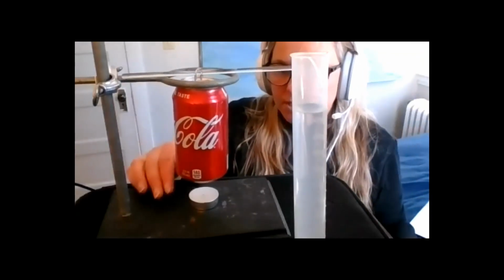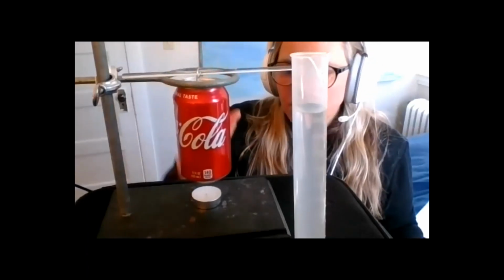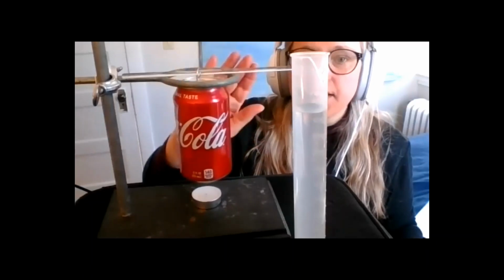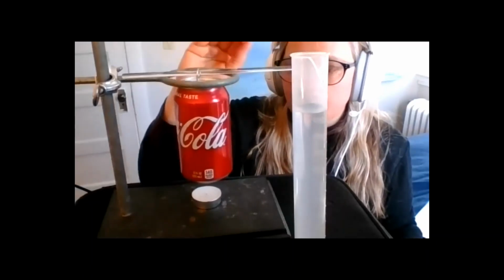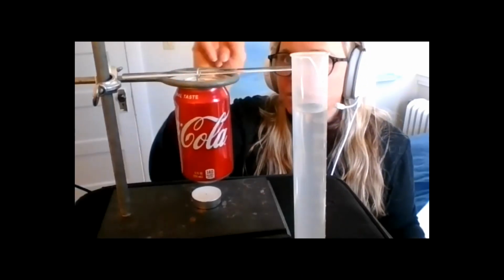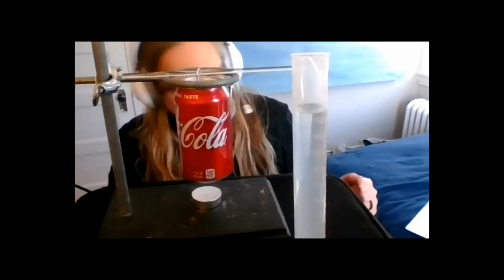Blow out the candle once it's at the goal temperature and wait. It might heat up just a little bit longer. It'll take a little bit of time for it to get its highest temperature. And then once it reaches its highest temperature and starts coming back down, take that highest temperature you're able to reach, and that's the number you're going to want to use.